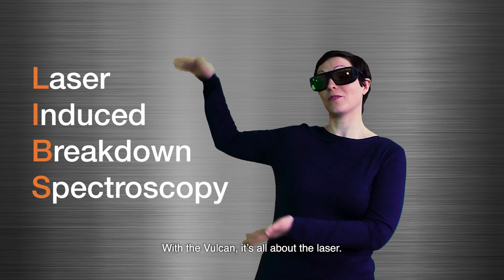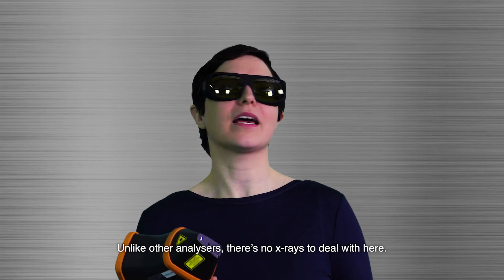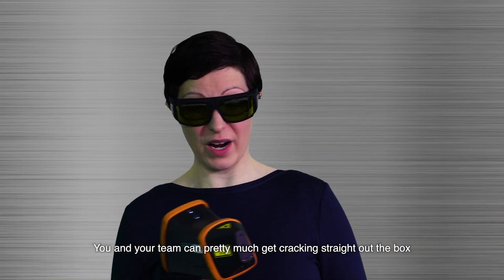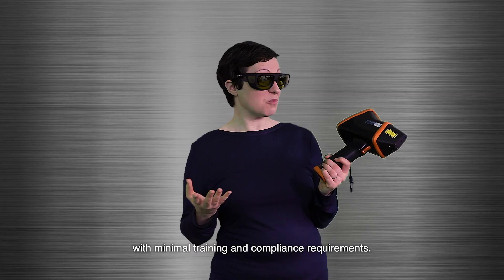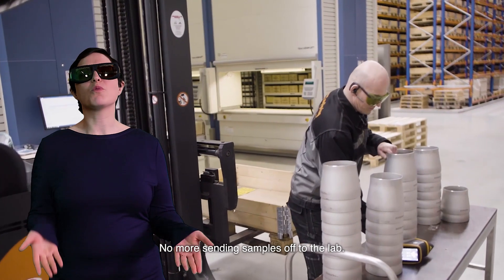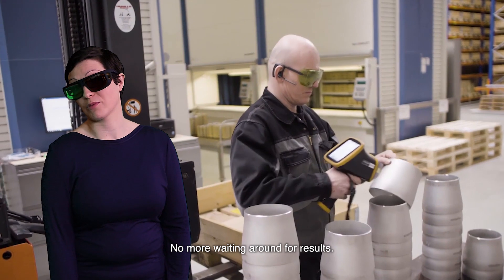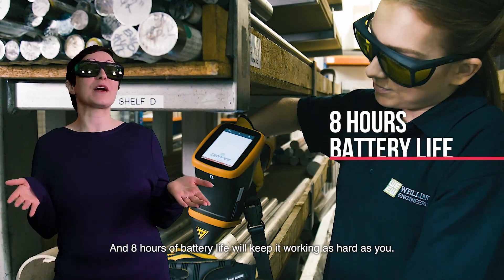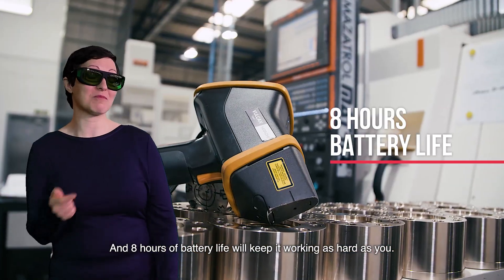With the Vulcan, it's all about the laser. Unlike other analyzers, there's no X-rays to deal with here. You and your team can pretty much get cracking straight out of the box with minimal training and compliance requirements. No more sending samples off to the lab, no more waiting around for results. And eight hours of battery life will keep it working as hard as you.